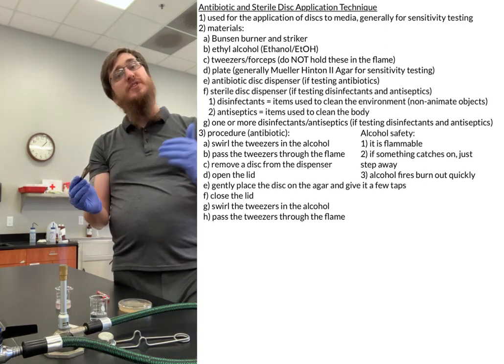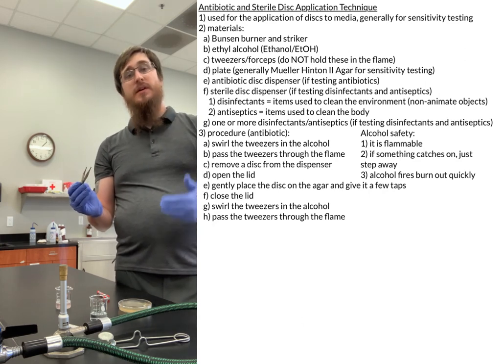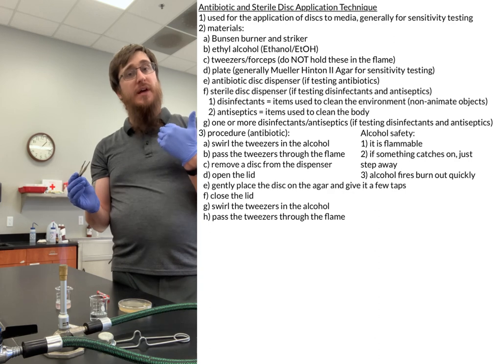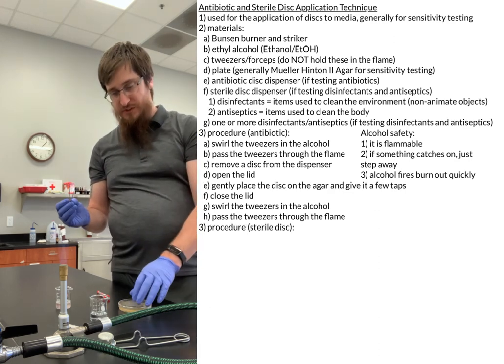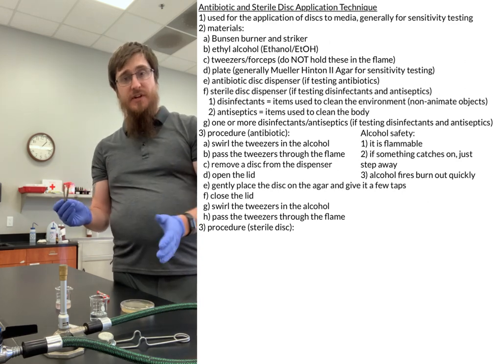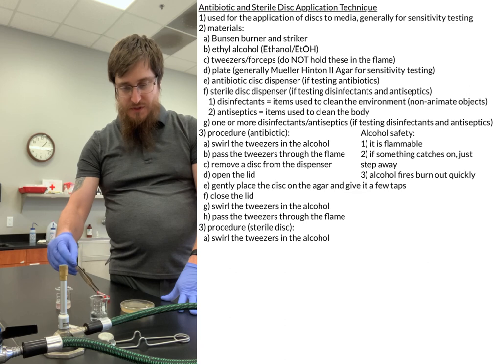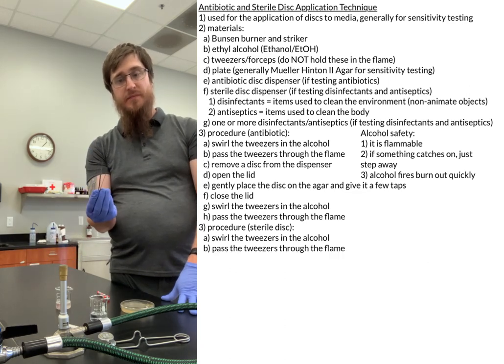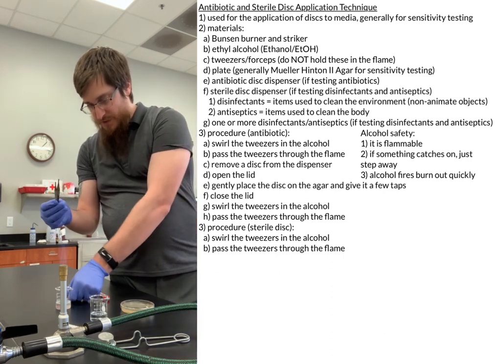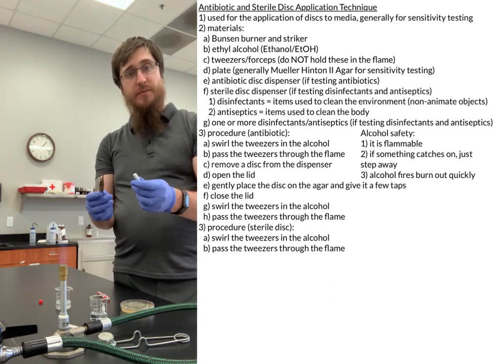So those are going to be the steps that we're going to be using if we're using an antibiotic disc. Now let's go ahead and do the one where we're adding a disinfectant or an antiseptic, where we have to use the sterile discs. So again, we're going to start out the same basic way: get your Bunsen burner going, dip your tweezers in the alcohol, pass it through the flame until they catch on fire, give it a little bit of time to cool down. Then we're going to use the same kind of trick again.